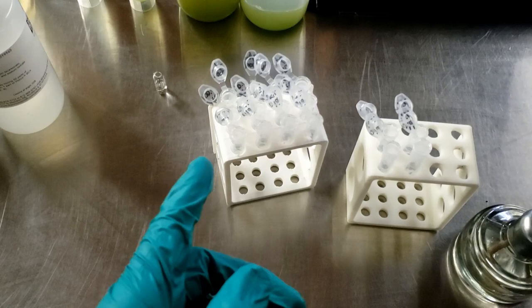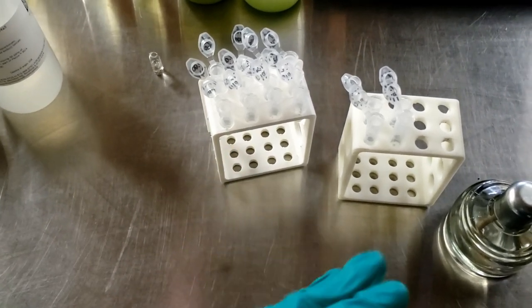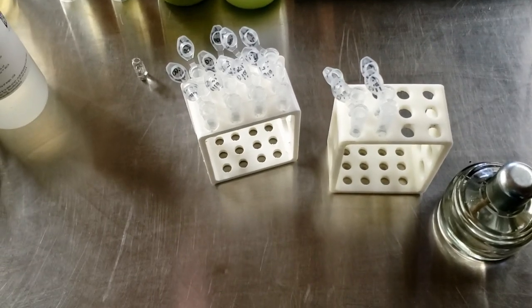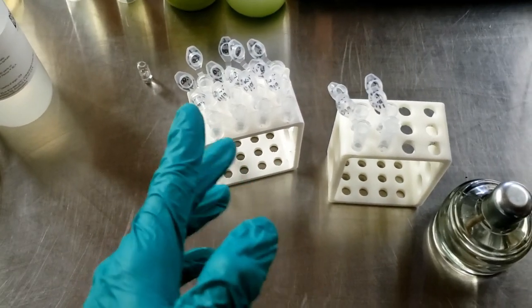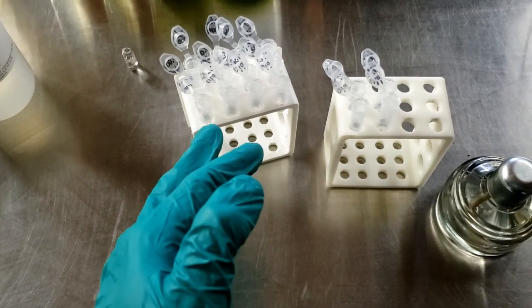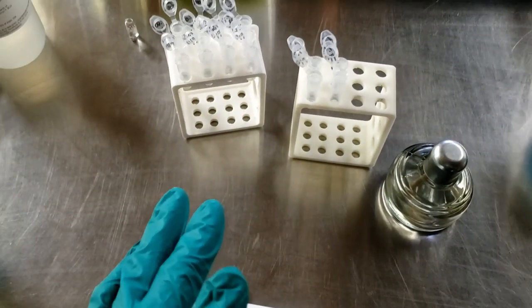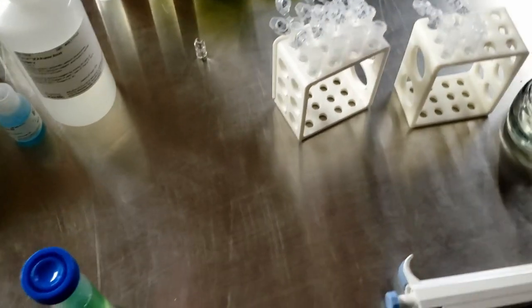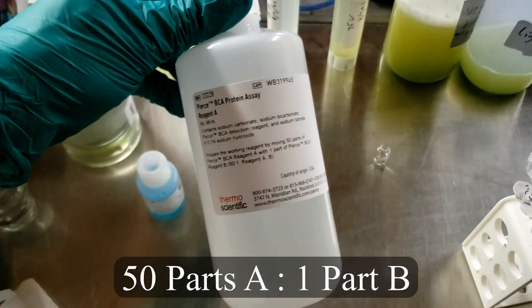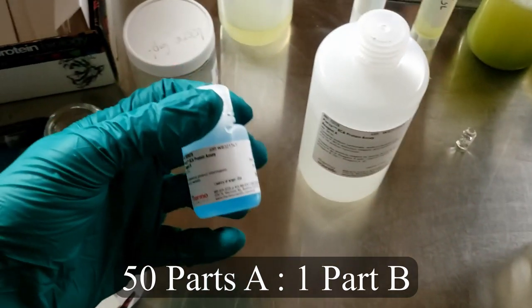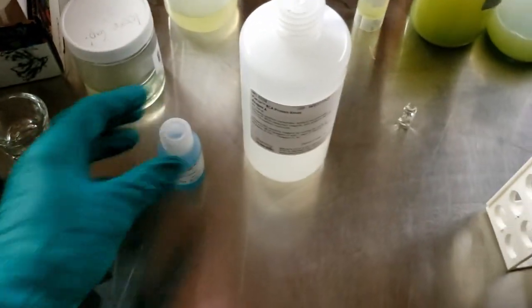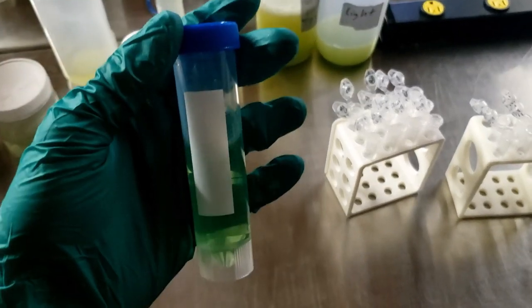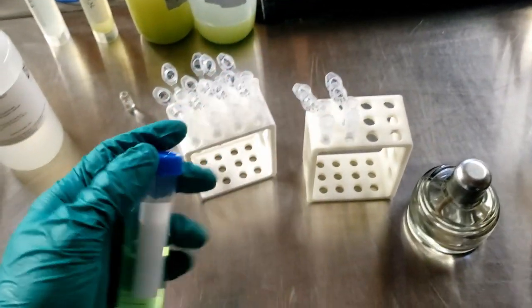Additionally, if you're measuring something that has anything greater than 2 grams per liter of protein, you'll have to set up serial dilutions as well. The experiment requires 100 microliters of whatever sample you're doing, whether it's the standard or the unknown sample. The next step is to take 50 parts of the A solution and one part of the B solution and mix them together. Then you'll put 2 milliliters of this solution in each of these tubes.